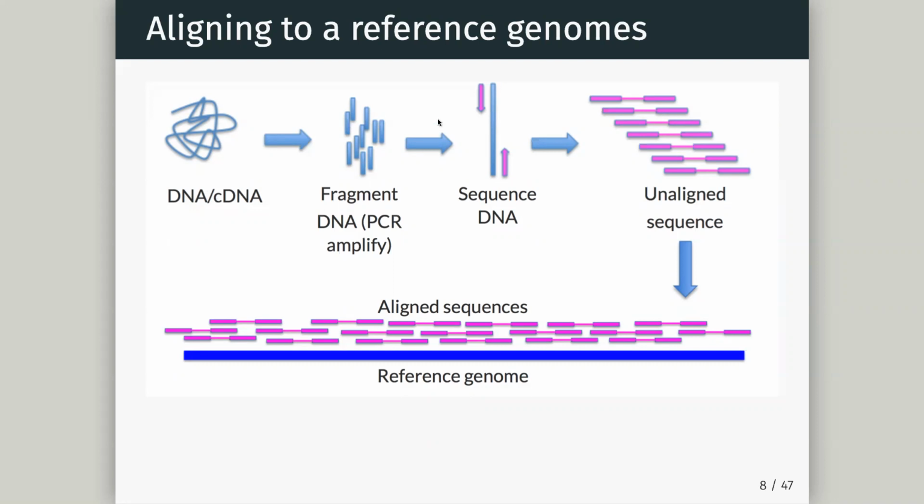And then using the Illumina sequencer, and Connie will come in and give us a short talk about the Illumina sequencer. Connie's our head of genomics. We can often sequence just the ends of these fragments we've created from our cDNA or DNA. We sequence just the ends, and sometimes we can sequence these knowing they're paired. So I know that this sequence here and this sequence here come from the same fragment.